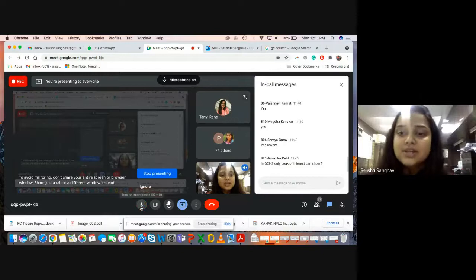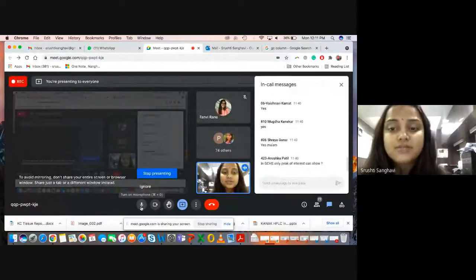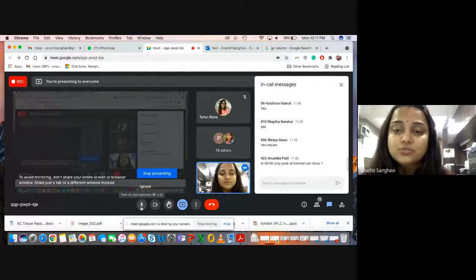So Anushka is asking, in GCHS, only the peak of interest can show? No, Anushka. In our example, the reason only the peak of interest was seen was because it was the most volatile component of the perfume sample. Let me go back to that example again.